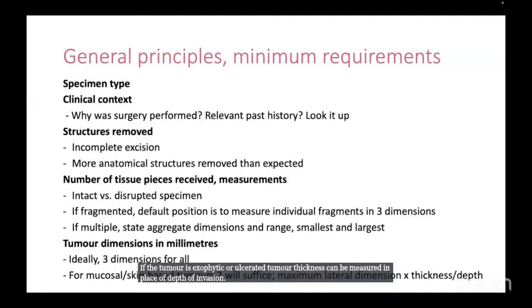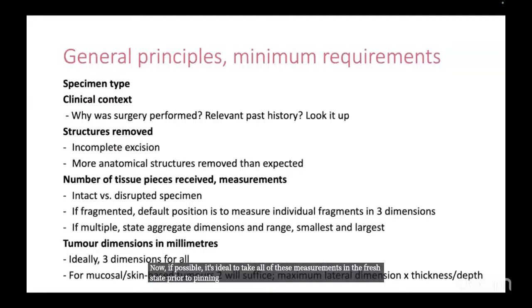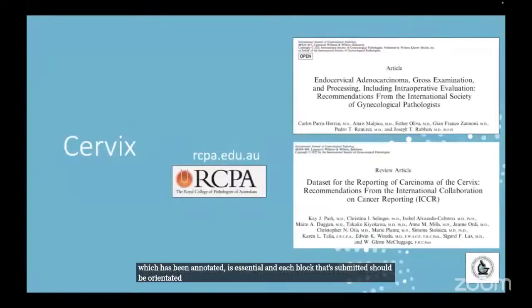Now, if possible, it's ideal to take all of these measurements in the fresh state prior to pinning out a specimen for fixation. And finally, a dedicated and detailed block key, supplemented if possible by a specimen photograph which has been annotated, is essential. And each block that's submitted should be orientated to the specimen.